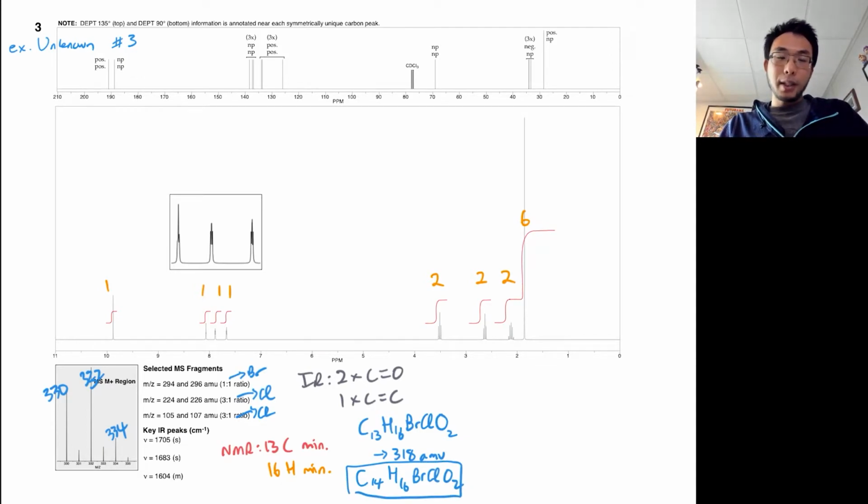The reason I feel comfortable doing that is that actually in the proton NMR, there is this very large signal for 6 hydrogens. There's no way for one carbon to have 6 hydrogens on it. So this is almost certainly coming from a set of carbons and their hydrogens, right? So there's got to be some symmetry in this molecule, which then means that definitely there is at least one signal in the carbon NMR that's showing up at the same location as another one, which means that I counted 13 signals, but I don't actually have 13 carbons. Again, there was some symmetry indicating I should have a little bit more. It looks like I actually had just one more than I expected.